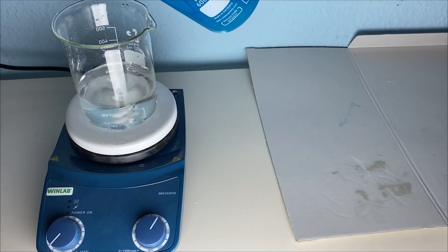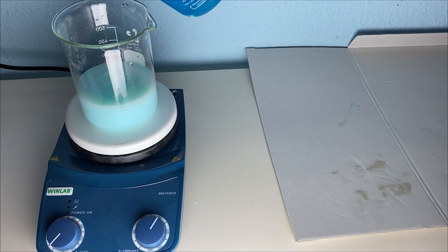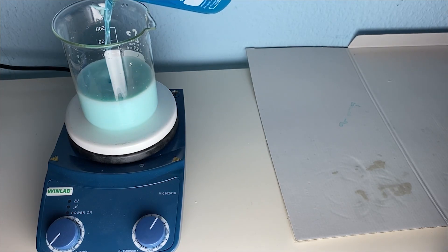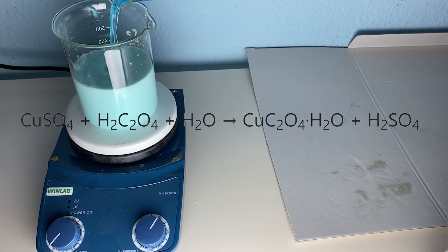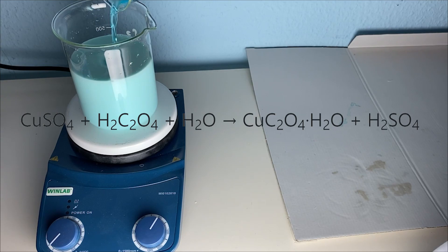Now I'm ready to start the reaction by adding the copper sulfate to the oxalic acid. We can see that there is a nice cyan color precipitating out instantly. What is happening here is that copper sulfate and oxalic acid are reacting to form copper oxalate and sulfuric acid.